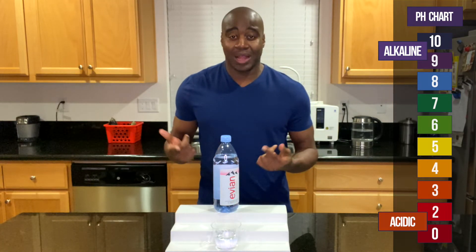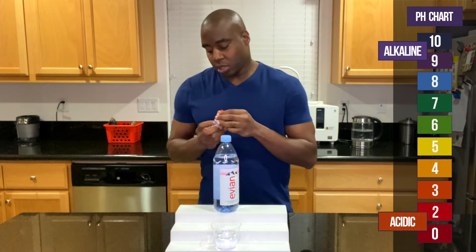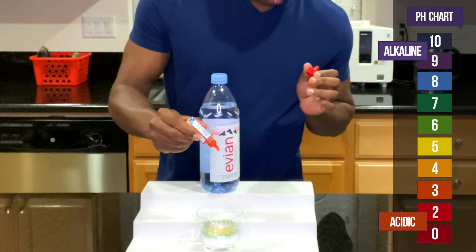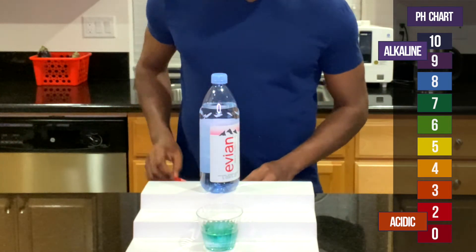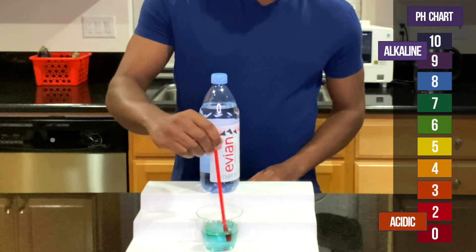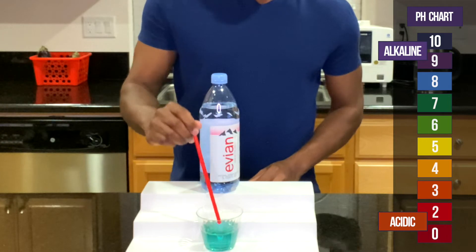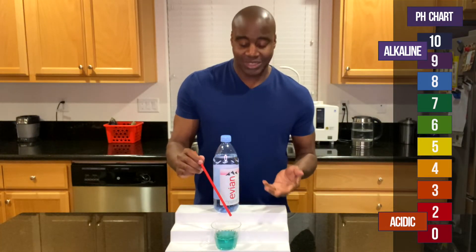And if it is alkaline, I'm going to test it and see how well it balances that acidity. Let's go ahead and put it in these pH drops — boom. And it is looking slightly alkaline. It looks neutral on my side, but it may look slightly alkaline. So I want to blow into it and see if it changes its alkalinity or if it actually stays the same.